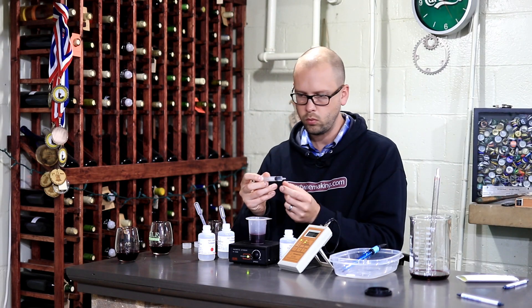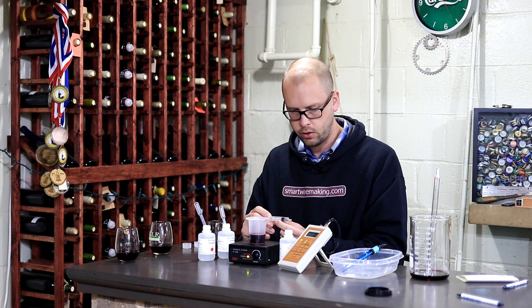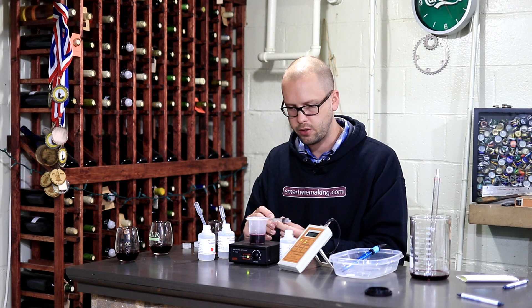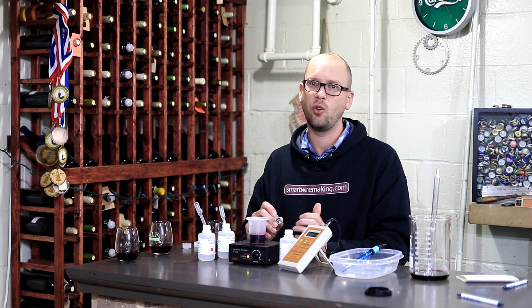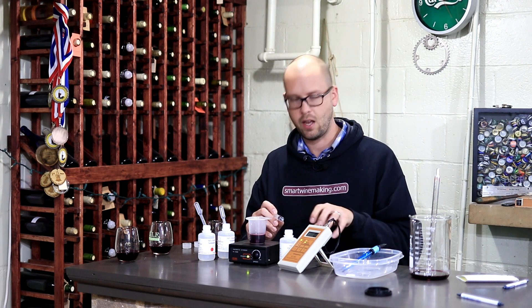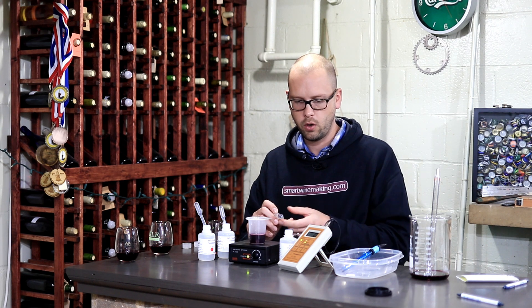We're reading about 1.8 on this one, so we've used 3.2 milliliters — that's 3.2 times 20, which is 64 parts per million. So again, this wine is going to be good to go. If I'm going to bottle a wine, whatever the target number is based on those charts, I'm going to overshoot that by about 10 to 15 parts per million, because the oxygen I hit that wine with during the bottling operation is going to suck up probably 10 to 12 parts per million of free SO2.